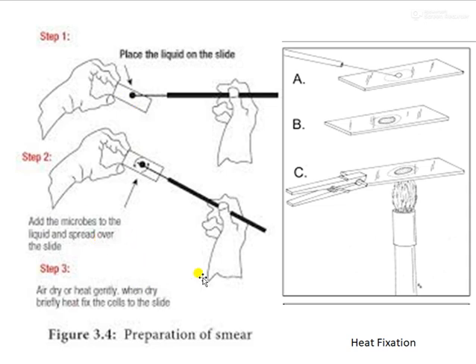During the preparation of a smear, you will have to heat fix it. Of course, you keep the glass slide intermittently on the flame, not for a long time, because the slide might break. Just place it over the flame and immediately pull it back, so that the cells get heat fixed onto the slide. For most staining techniques, we do heat fixation so that the microorganism is killed and inactivated, and it adheres onto the glass slide.